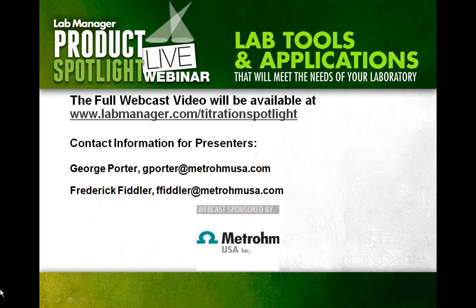That's really good to know. And about other titrations, are there any other factors that people should be concerned about? Now, when you're looking at the non-thermometric titrations, actually temperature can be a pretty big influence, especially when you're measuring something like pH, which is a derived unit, and temperature can influence the pH being read if it's not corrected for.